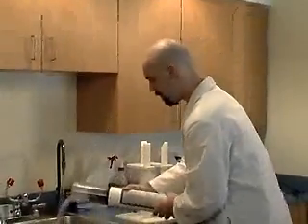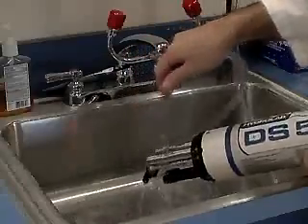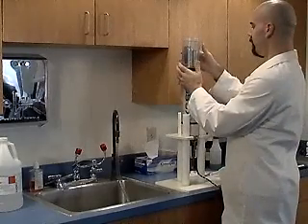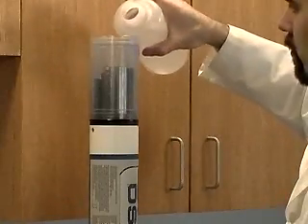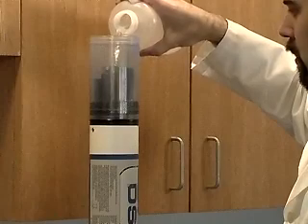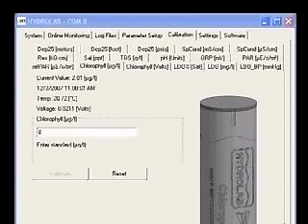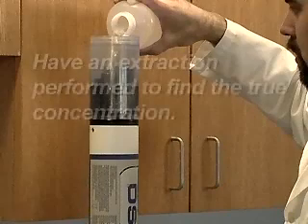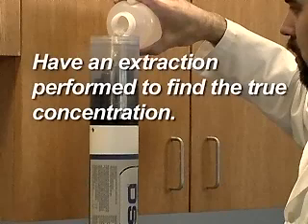Empty the storage cup and rinse the sensors. Dry the sensors and attach the storage cup. Fill the cup to the threads with a fresh sample from the deployment site. Wait one minute for the readings to stabilize. If you are using a solid standard for calibration, record the current micrograms per liter value.